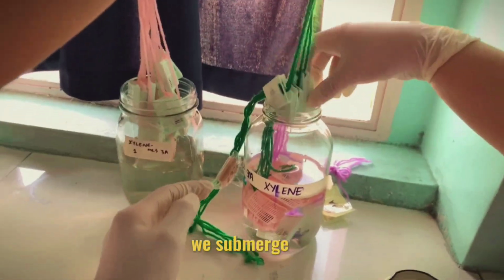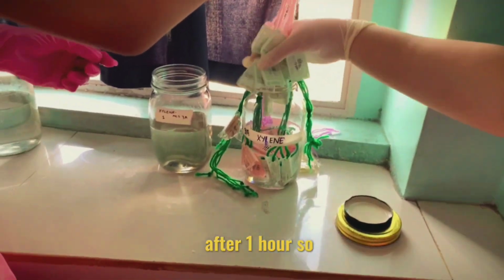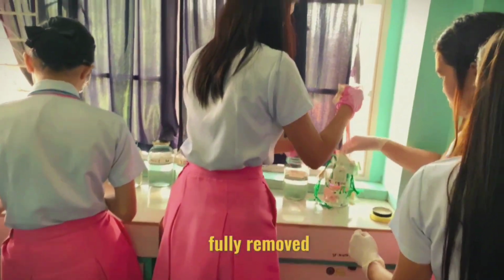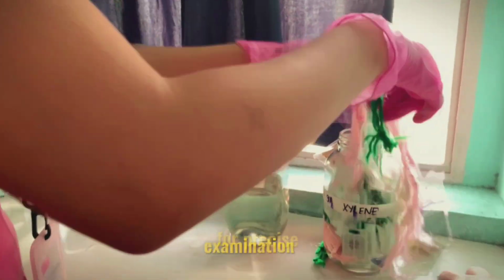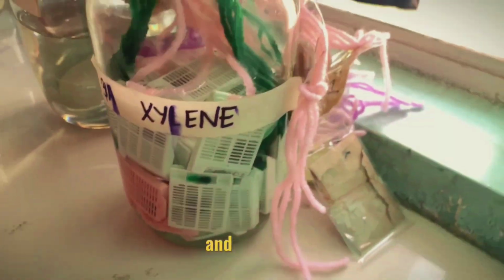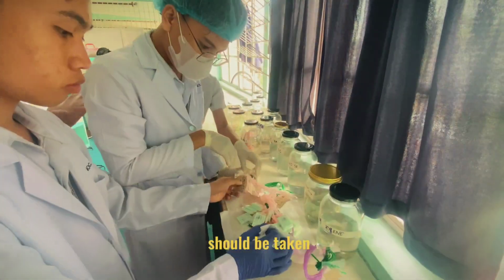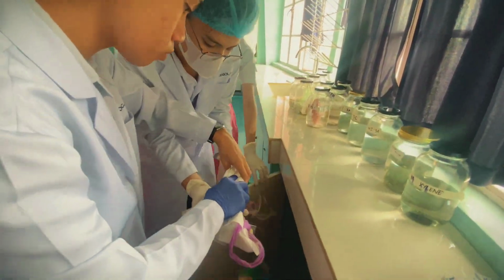We submerge the tissue in xylene 2, and after 1 hour, the tissue is removed, ensuring any residual alcohol is fully removed. This two-step approach improves clarity and prepares the sample for precise examination. Using xylene in two stages ensures optimal tissue clarity, leading to better staining results and ultimately more accurate diagnosis. After clearing, the tissue samples should be taken out of the jar and then stored first.